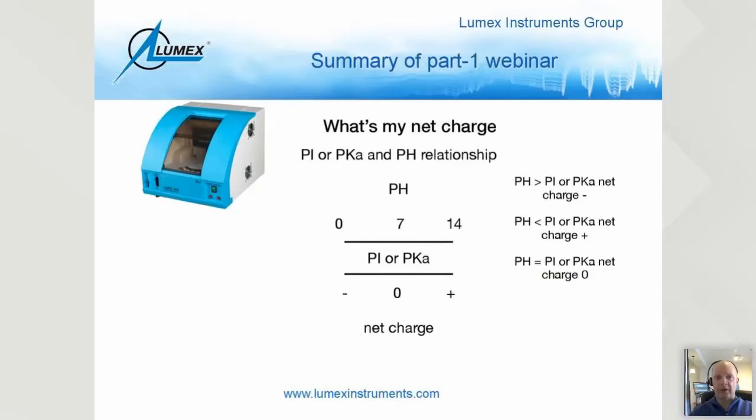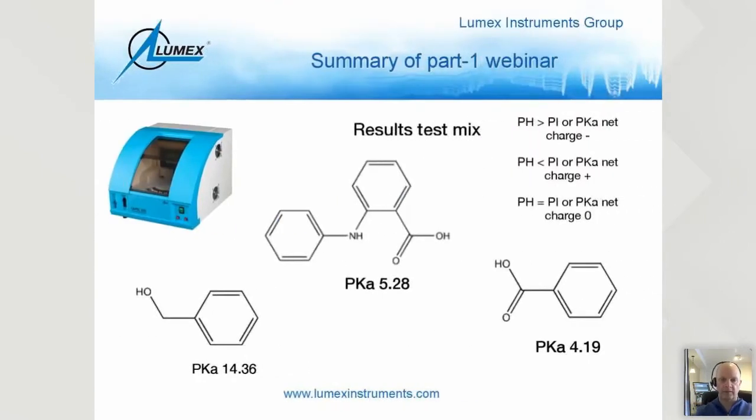Next piece of the puzzle that I had presented was, what's my net charge, or my pKa relationship to my pH, the pH of the buffer? If you remember, basically, I had presented this table that I've created, which gives you a general idea as to where things are situated.